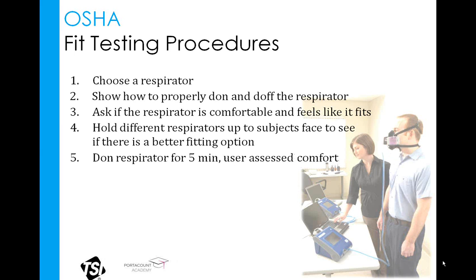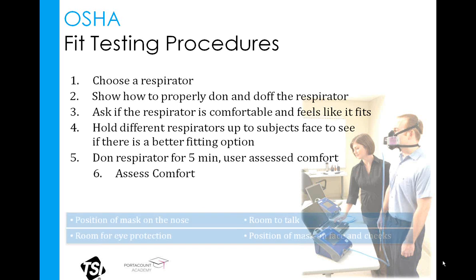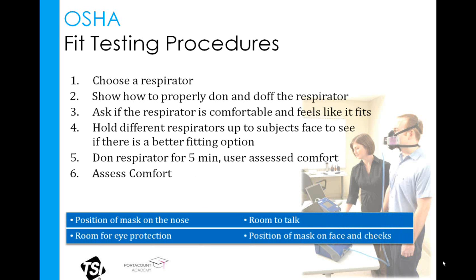Step 5, which I sort of referenced earlier, is the one most people forget to do, and that is to have the employee don the mask for 5 minutes before beginning the fit test. That's your user assessment comfort period. Okay, so step 6 is where we have the employee assess the comfort of that mask. Again, they're doing this during the user assessment comfort period. It's been donned for 5 minutes.